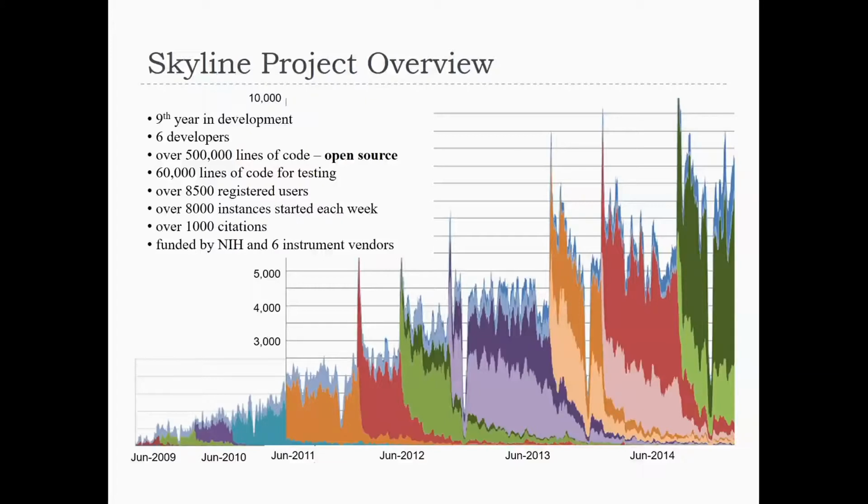You can use both side by side. You have to be a little bit conscious that if you save a document with the Skyline Daily Release, you may not be able to open it with an older release. But we've seen a lot of people picking up the Skyline Daily Release, which we also take as a good complement to the level of stability that we're able to maintain with all these tests that we run so frequently.